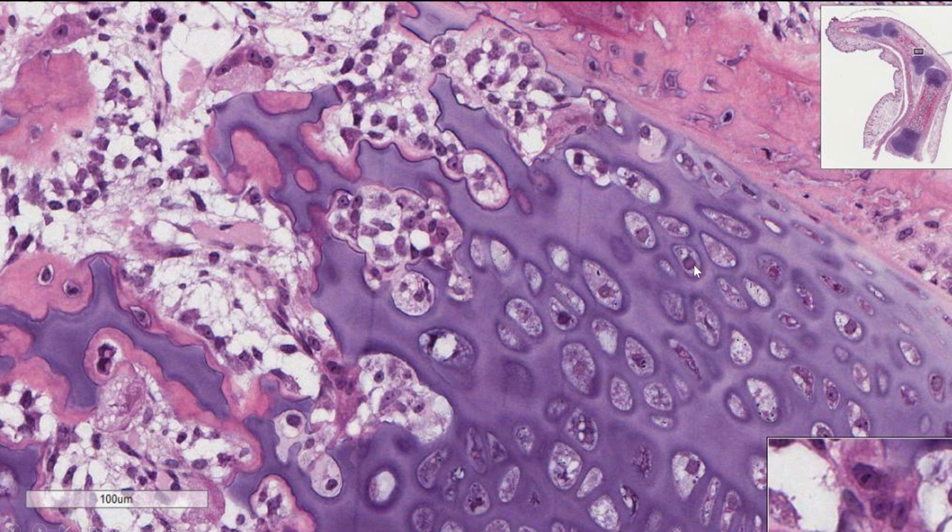Okay, so here you can see, so again, this is that barrier where we're changing from hyaline cartilage to bone, and so you can see there's a lot of activity going on over here. So we're going to do some practice and try to identify those 3 big types of cells. So here you can see this cell, right? It's not 3 different cells, it's actually one big cell with multiple nuclei within it. So that is going to be an osteoclast, right? Because remember, osteoclasts are multinucleate. So that is going to be a multinucleate osteoclast.